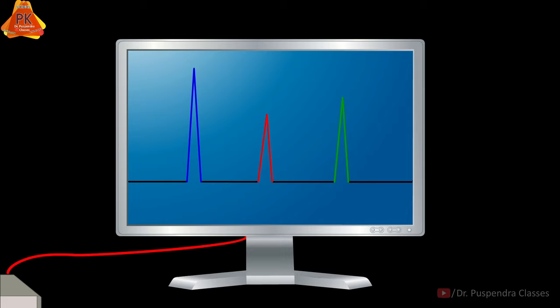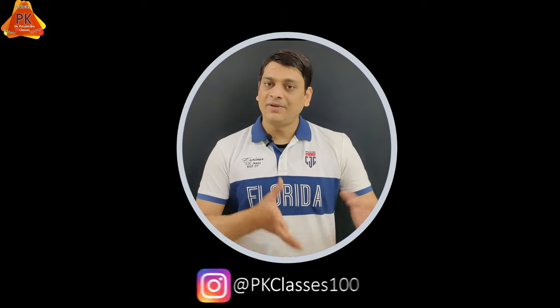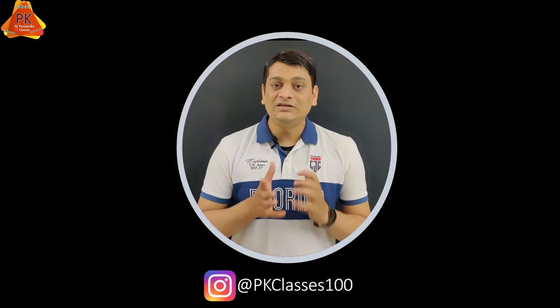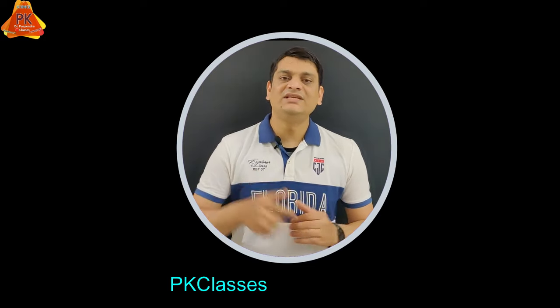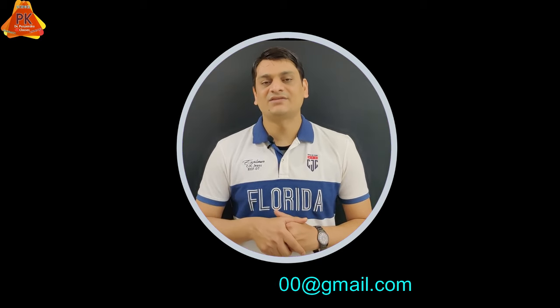Ultimately, all signals will appear in the recorder. We have discussed the details about instrumentation and working of HPLC. I hope you clearly understand the concept of HPLC. We have done a lot of hard work to make this animation possible, so I personally request you to share this video as much as you can. If you are a teacher, you can use this animation to explain the concept of HPLC to your students, which will be highly beneficial. It should be for non-commercial purpose, but if you want to use this animation for any commercial purpose, you have to take written permission from us through our mail ID given on the screen. Thank you so much.